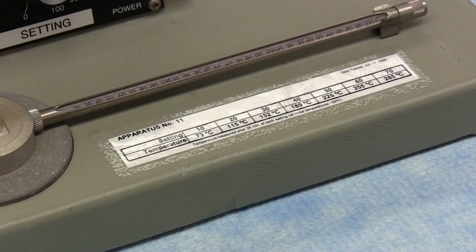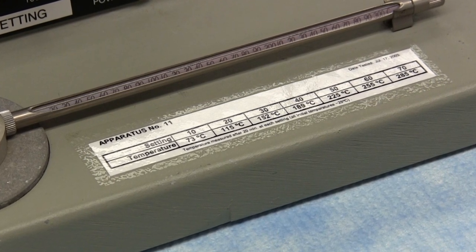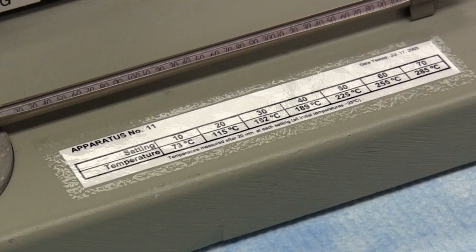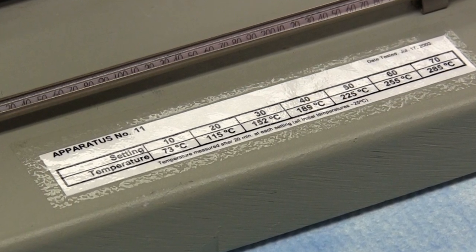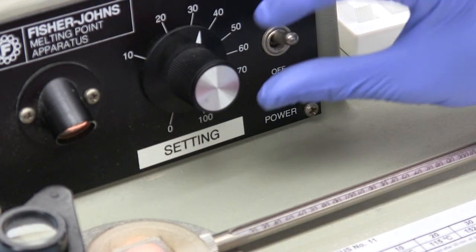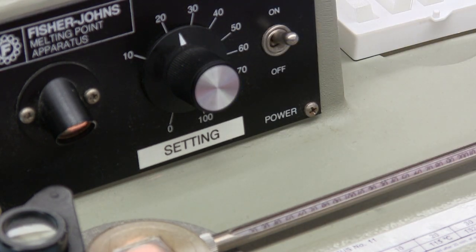This is best achieved by reading the chart on the apparatus, which shows the maximum temperature reached at each setting on the regulator knob. In this example, we expect a pure sample of the compound to melt at around 120 degrees. By reading the chart, we are going to adjust the temperature control to somewhere between 20 and 30, since this indicates that the stage should reach our melting point temperature at around that setting.